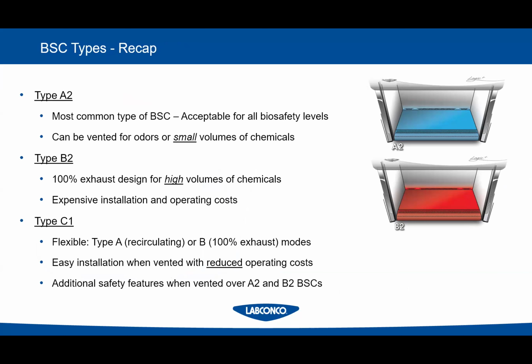They can be tricky to get working on mechanical systems, especially if you try and join them up together. And then there's the C1, which, in between moving them around or changing applications, you can recertify and either hook them up to a general lab exhaust. They play well with others on a general lab exhaust system as well. So that gets around some of those limitations that the A's and the B's have.